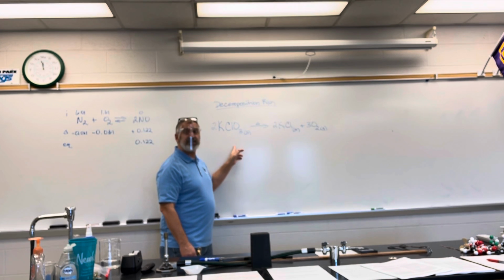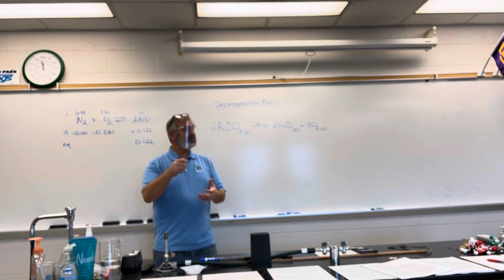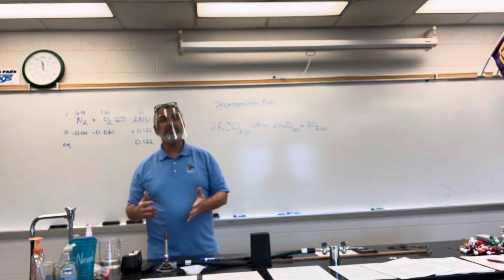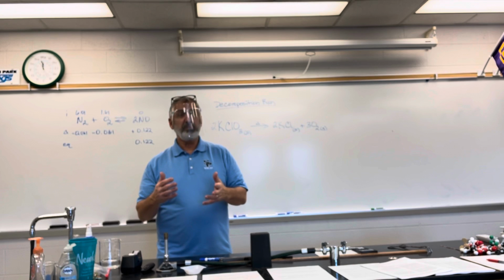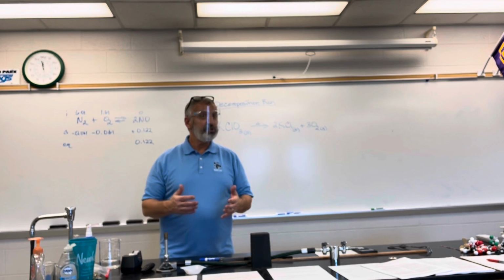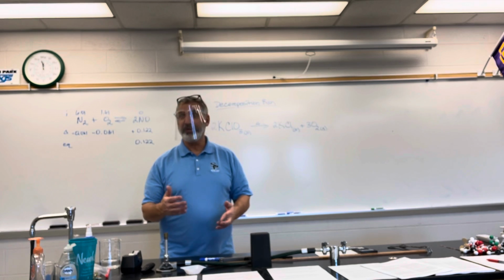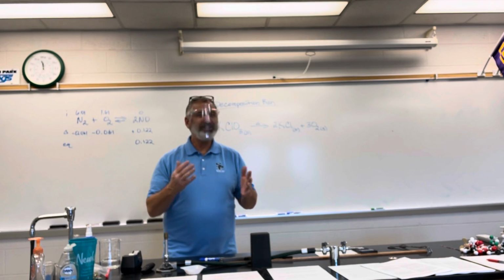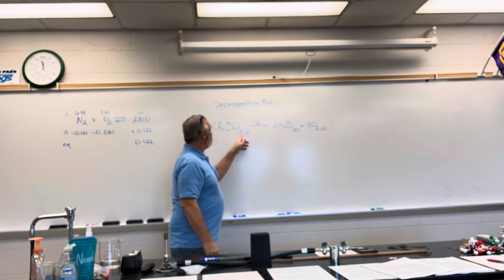Now we will need the mass of the crucible and the cover. So you're going to weigh it empty, and then while it's on the balance, just add until it gets about 2. Now you're going to have to do some mental math. So if the mass of the crucible comes out to 25.1 and you want 2 grams, you're going to have to take it up to 27.1. I think you can handle that. So, we're just going to follow the directions.